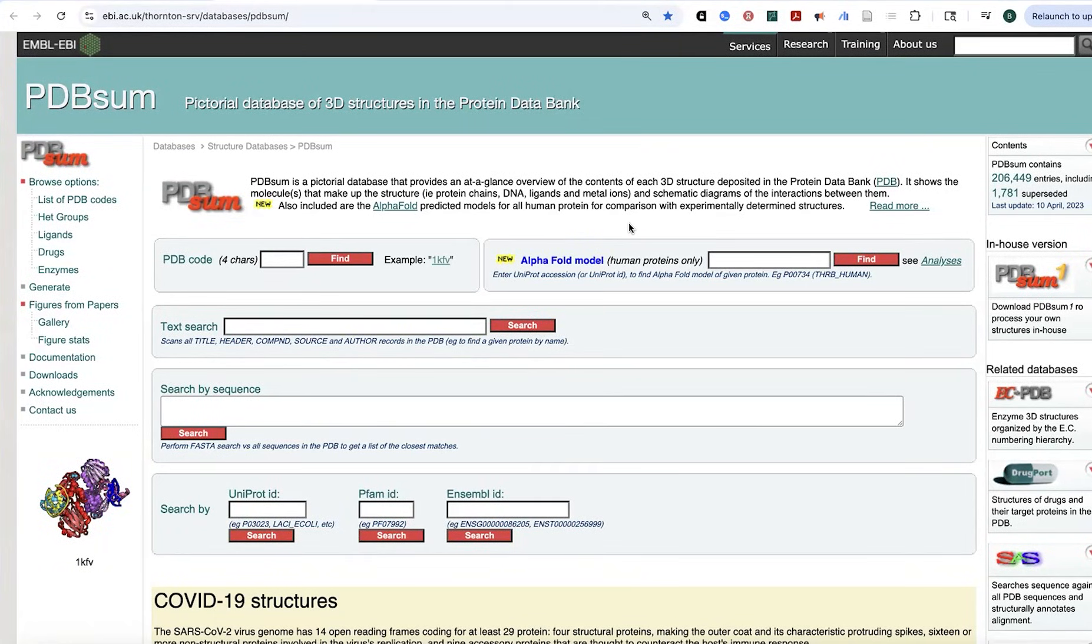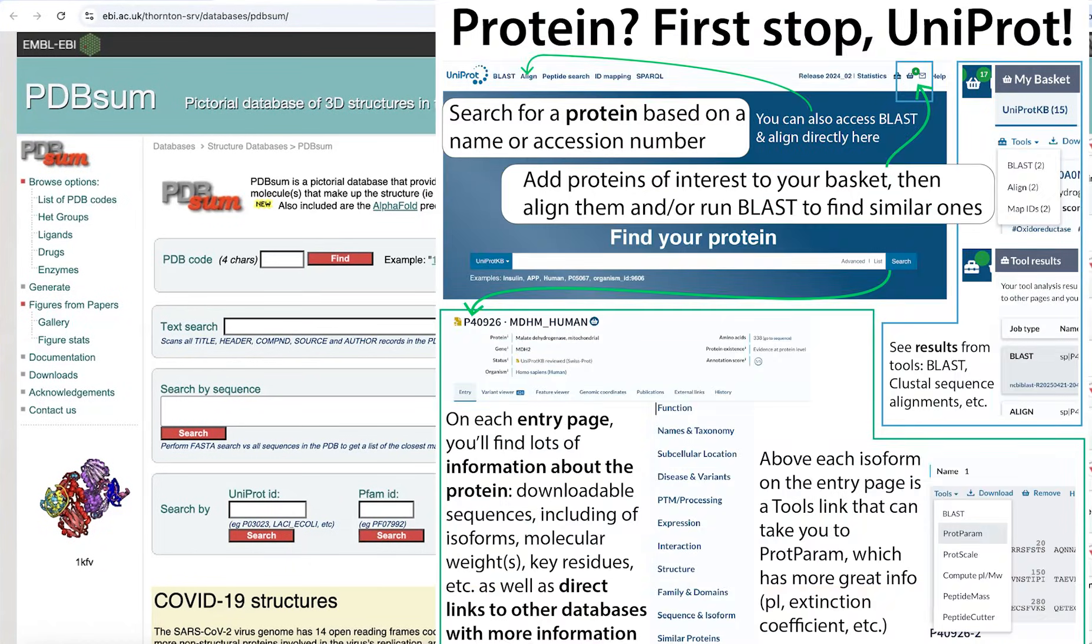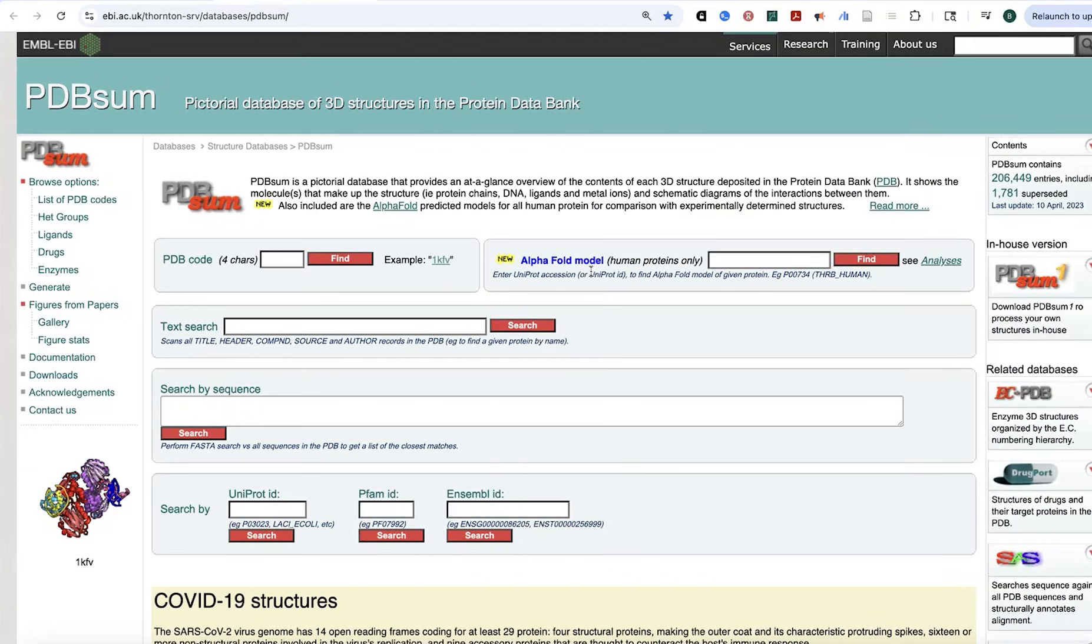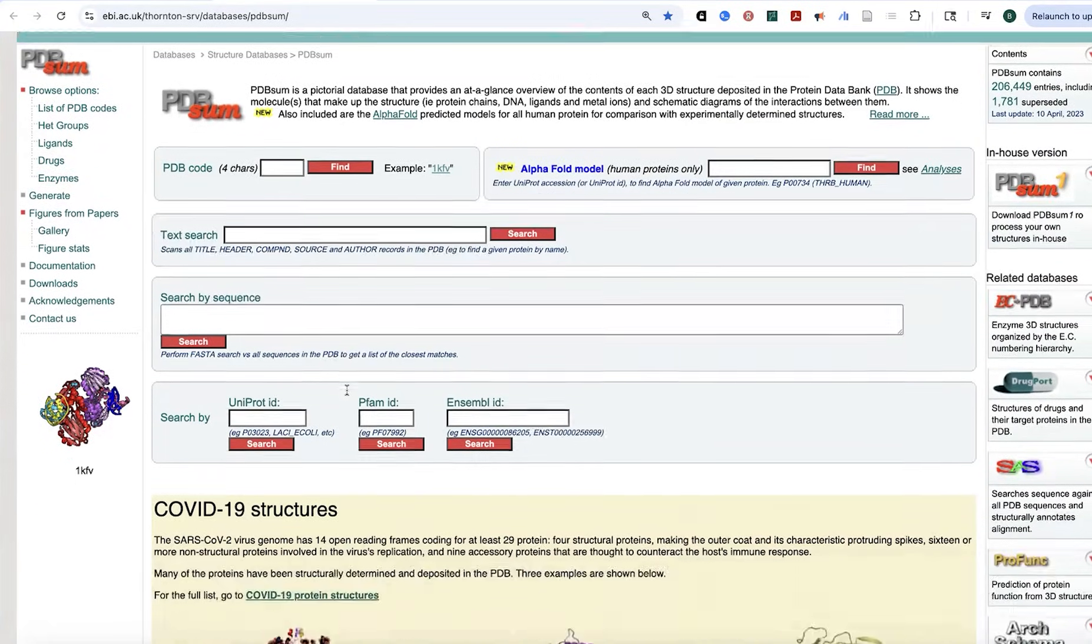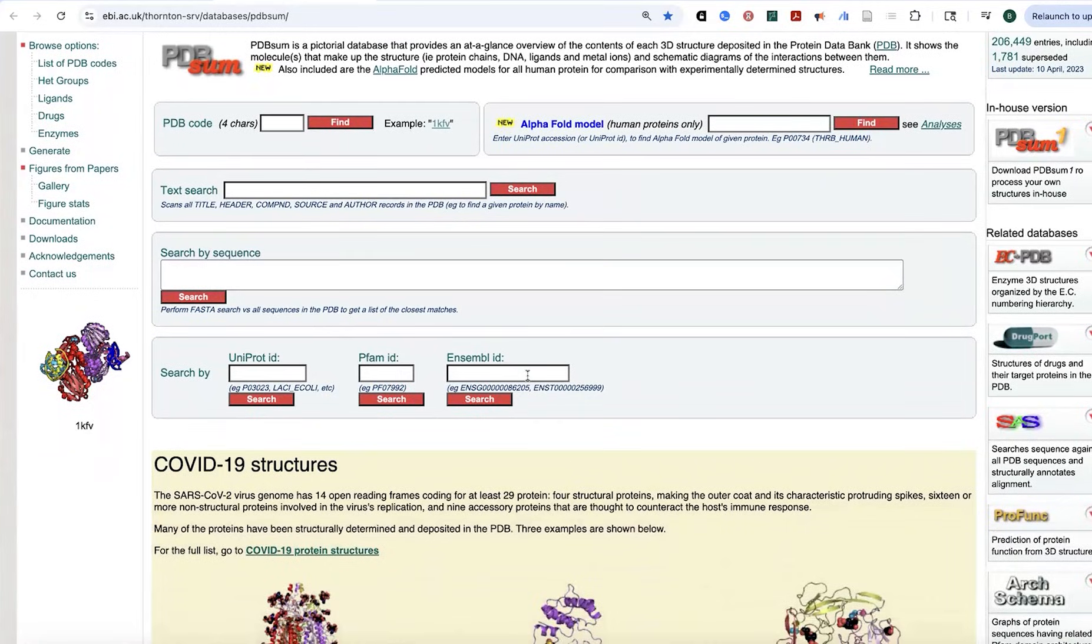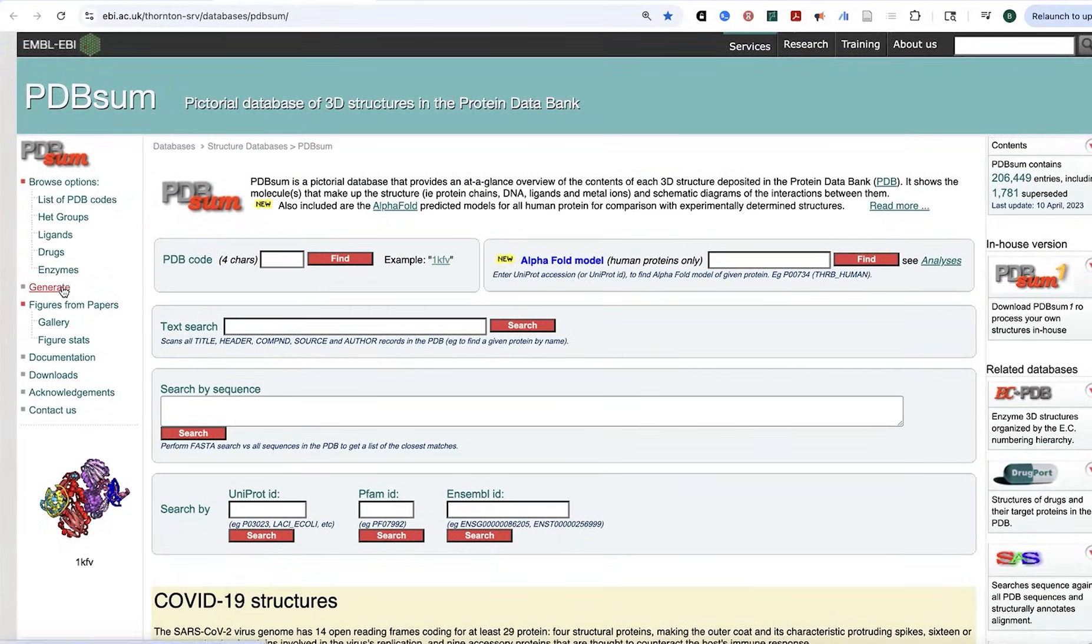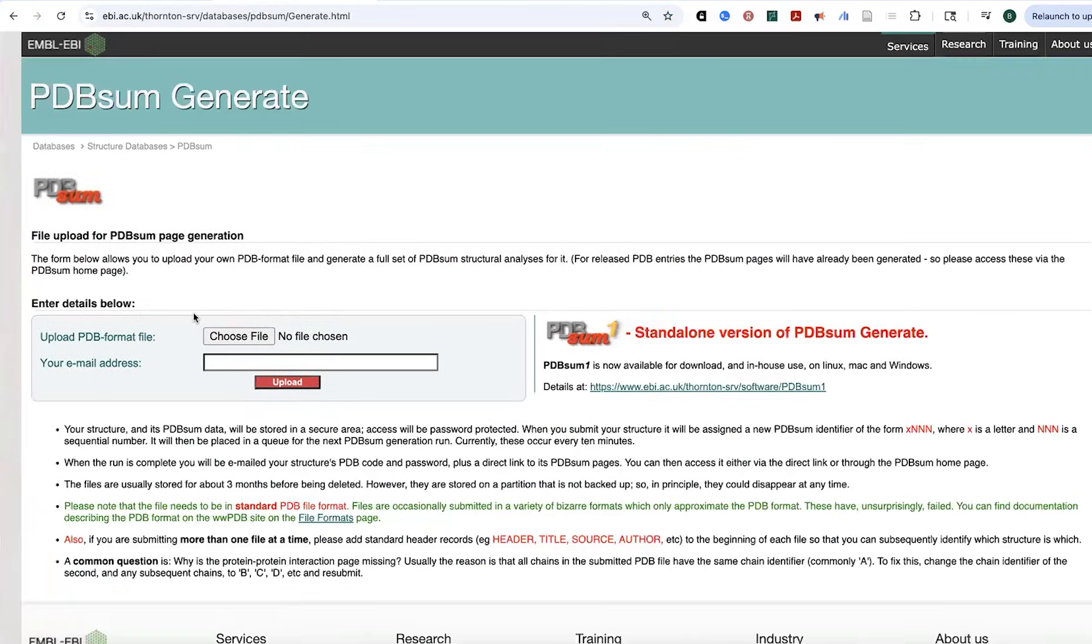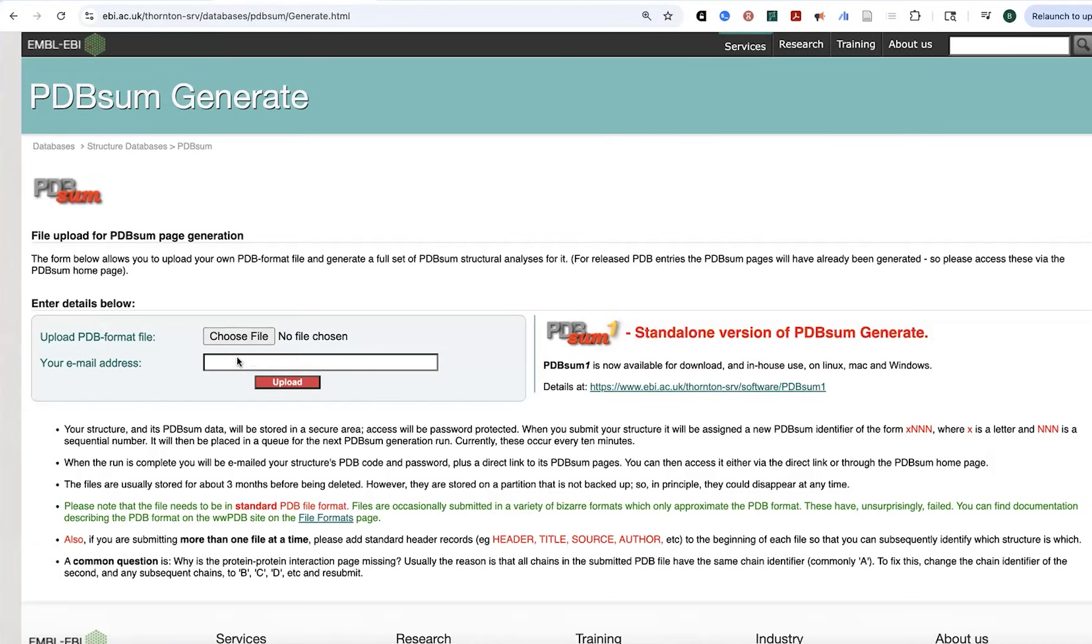Alternatively, if there's not a structure solved, you can actually have it find you an AlphaFold model by putting in the UniProt ID. The UniProt is the place where there's information about all the different proteins. You can also search based on sequence or various other IDs, or if you go to generate, you can upload a PDB file. If you have some custom PDB file, you can upload it here, and then you stick in your email, and it'll send you that.